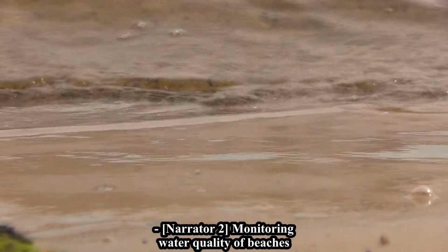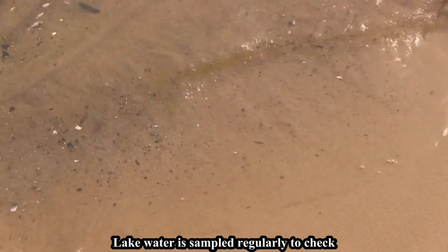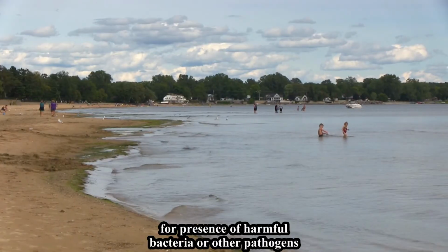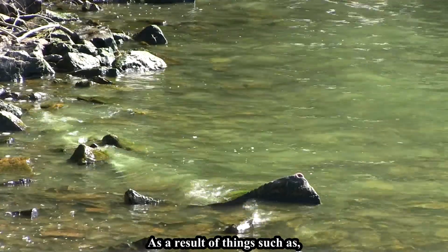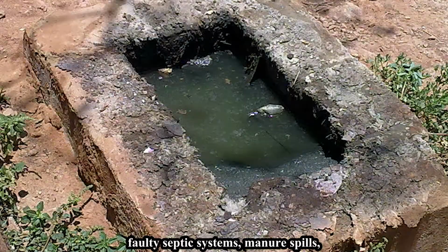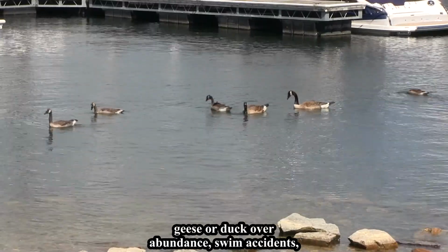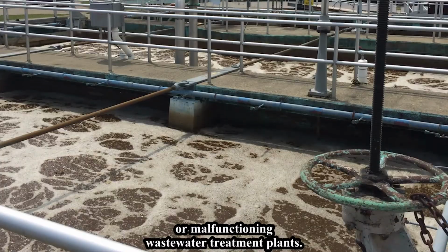Monitoring water quality at beaches is important to help ensure the safety of swimmers. Lake water is sampled regularly to check for presence of harmful bacteria or other pathogens that may be present in the water as a result of things such as faulty septic systems, manure spills, geese or duck overabundance, swim accidents, or malfunctioning wastewater treatment plants.